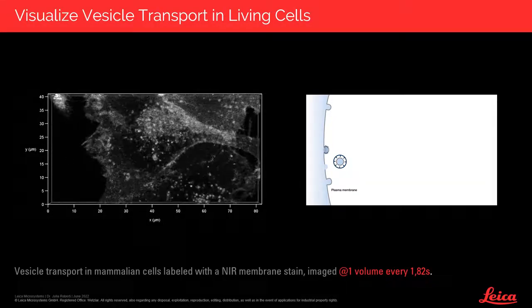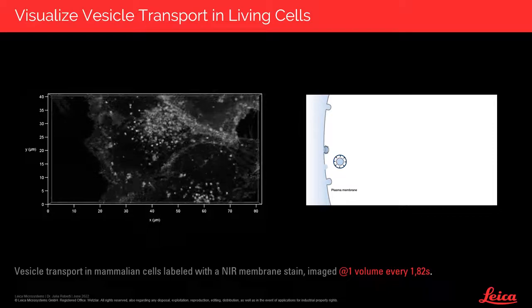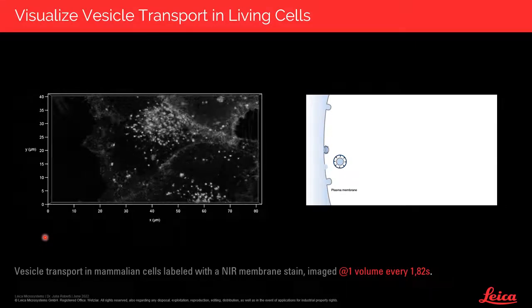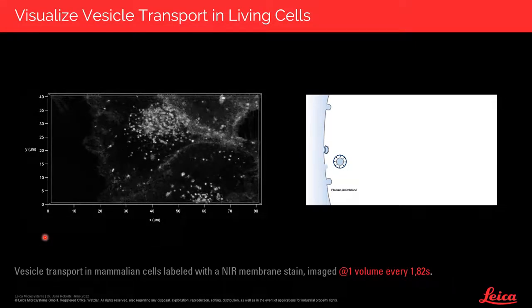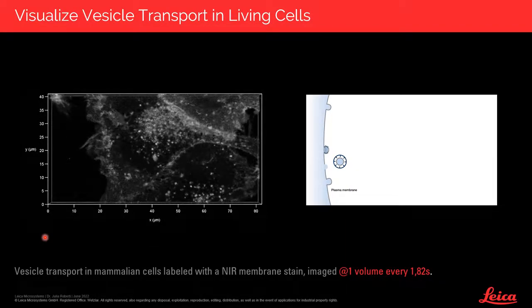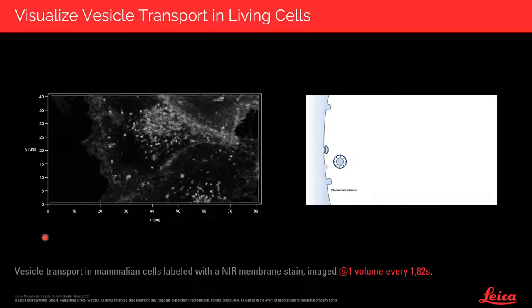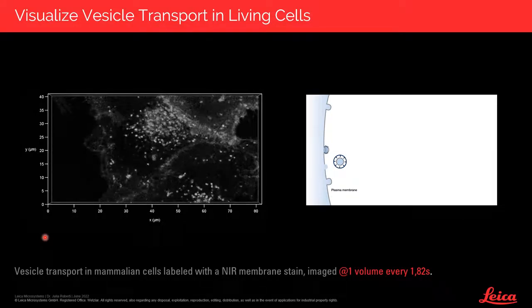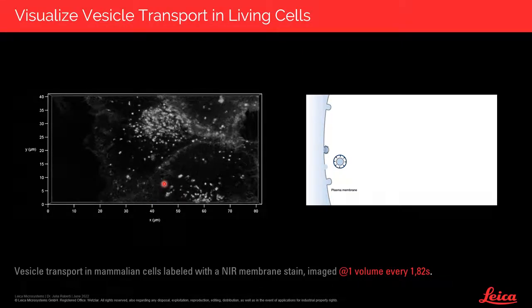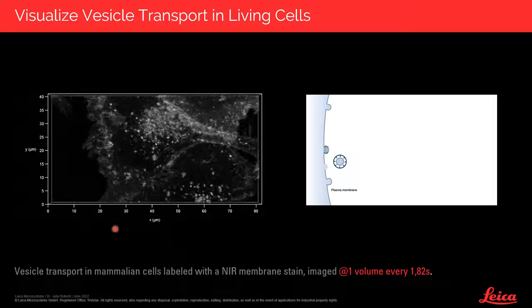As we know, fast processes happen at many different levels in the cellular environment, and to study them, we must of course be at the right speed, but that is not enough. We also want to learn something, and that comes hand in hand with understanding what's going on, which implies getting to grasp the function of the molecules. That is why speed needs a special extra, and to show you this, I will go back to the traveling vesicles, although this time I will start with a time lapse that shows fast transport in action.